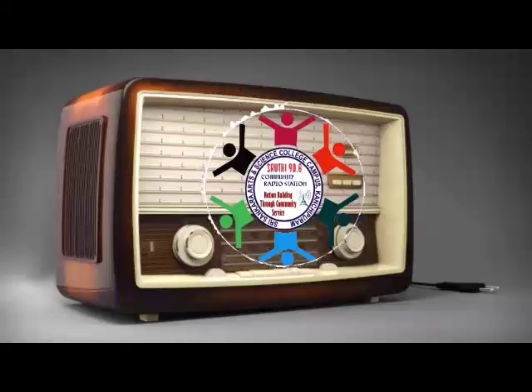In this type of reactor, aeration is supplied in the reactor but no mixing is applied. This type of reactor is rarely used. The third one is stirrer and aerated reactor. In this type of reactor, both stirrer and aeration are applied. This type of reactor is commonly used for the production of many microbial metabolites such as organic acids, vitamins and many antibiotics.